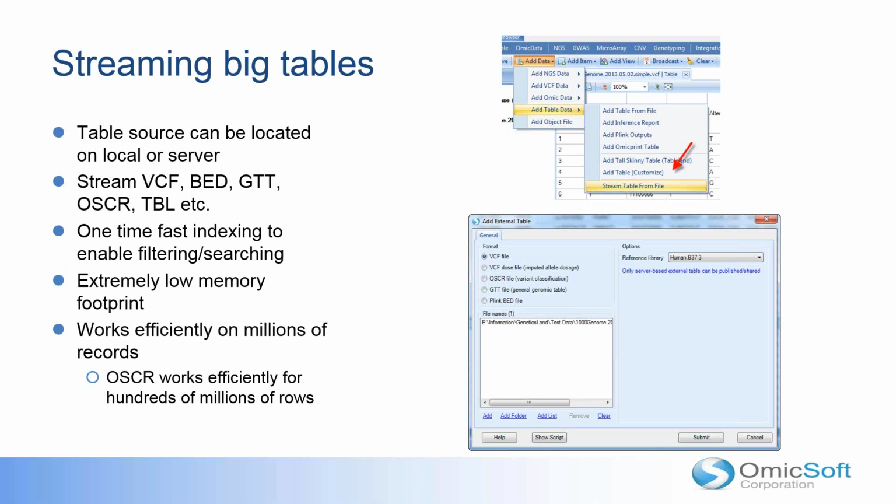But streaming takes one additional step further, to be able to not just search for a particular region, but also enable search by, for example, identifiers, RSIDs, and also allow users to see everything of them, not in a loaded way, but in a streaming way. I think I will quickly show this.